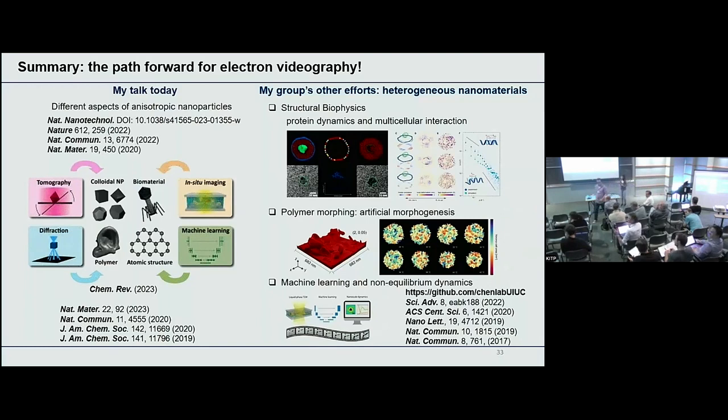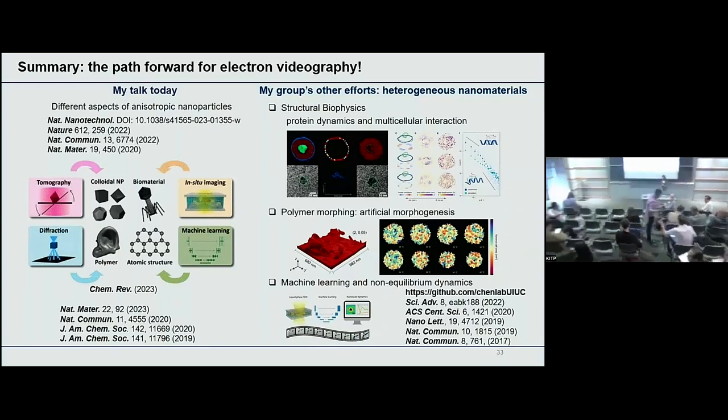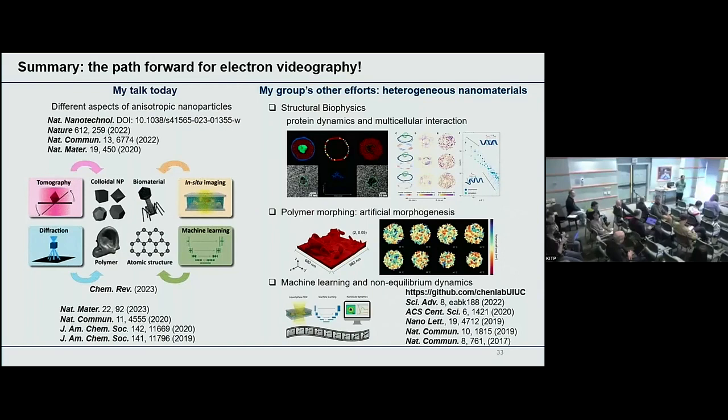Hi. So in your faceting studies, I'm curious, if you were growing a nanoparticle, you would have bonding, and there would be surface energies that would help define your faceting, right? And so I'm curious how you think that bonding would affect the development of your layer-by-layer versus continuous growth. Would that affect your regimes at all, or would you just get the same thing?